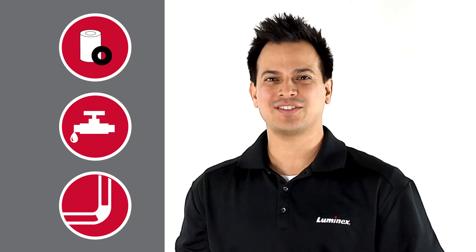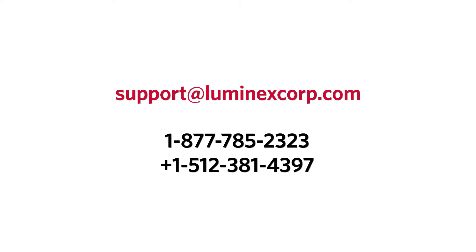If the leak continues after these troubleshooting steps, call Luminex Technical Support, and a specialist would be glad to help you from there.